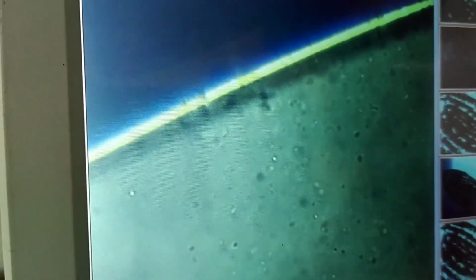Sometimes we can even observe the morphology of bacteria. Here we can see they are not cocci, they are not bacilli, that's cocobacilli. See, different levels of bacteria at different planes of the drop. And at the margin, see the sluggish motility. So this ends with the motility.